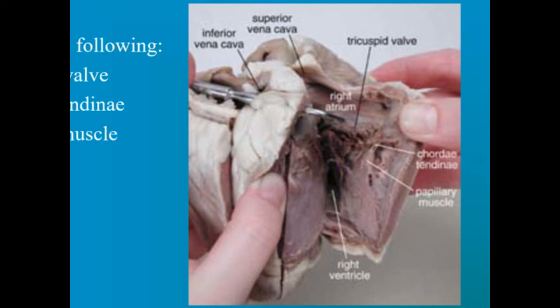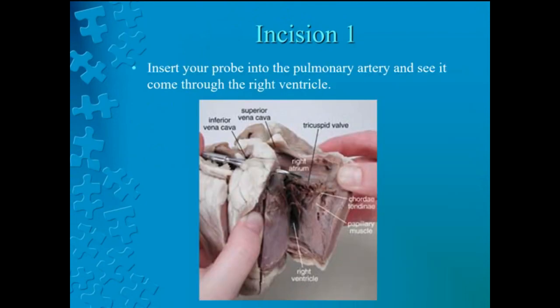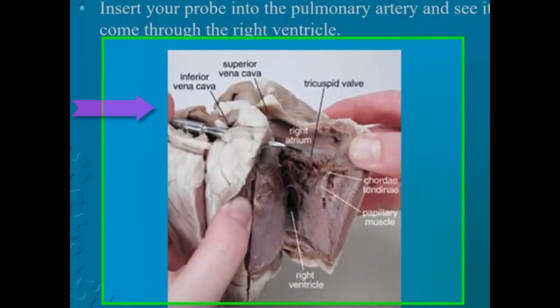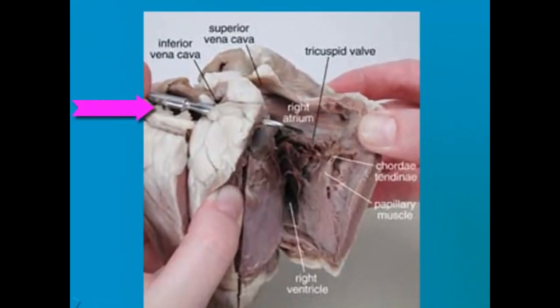Remember that the pulmonary artery is just behind and to the left of the aorta. Locate the pulmonary artery once again. After the video is paused, insert your probe into the pulmonary artery and see it come through to the right ventricle. We will pause for a moment to ensure that everyone has located the pulmonary artery.